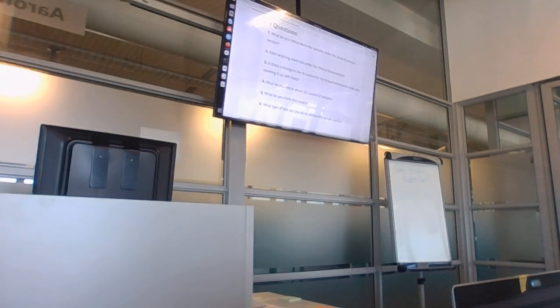You know what? I think what you did was when you selected that, right? I didn't click on it. Got too many tabs open, that's why it's slow. Is yours running?